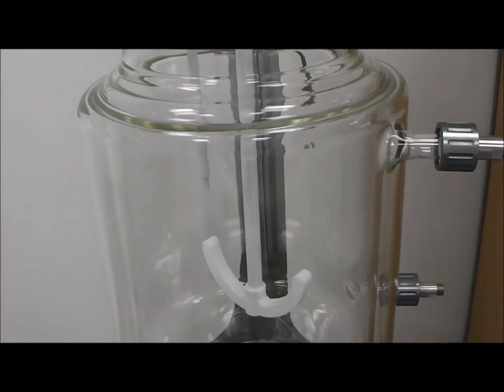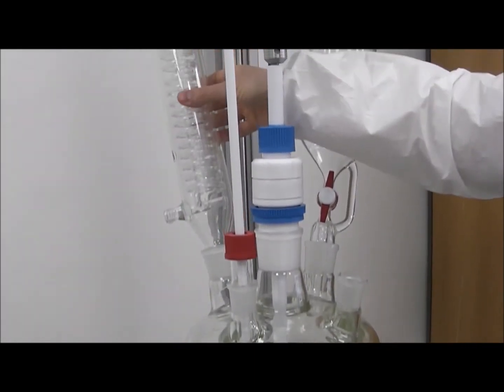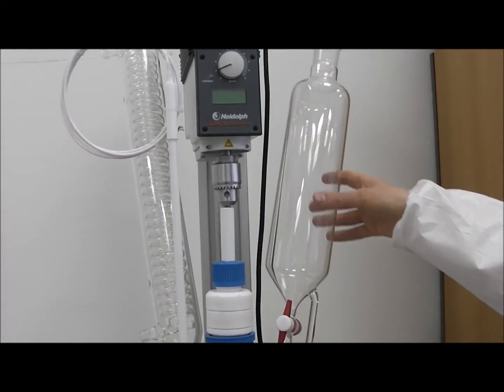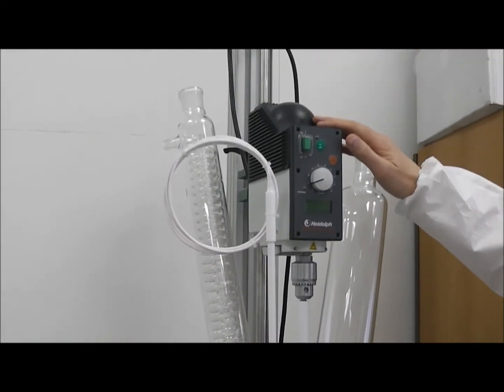In the lid we also have, in this example, a condenser also made by Glass Solutions, and a dropping funnel also made by Glass Solutions. And we obviously have an overhead stirrer as well.